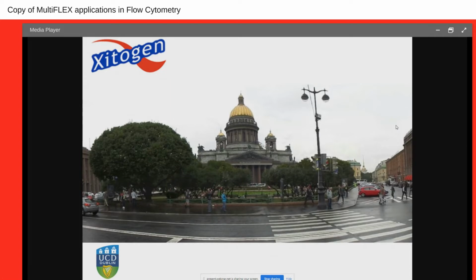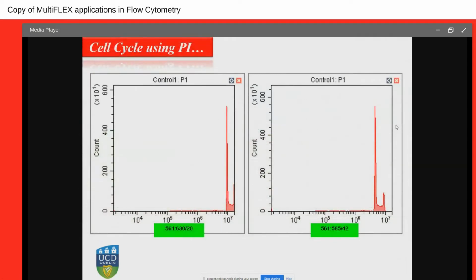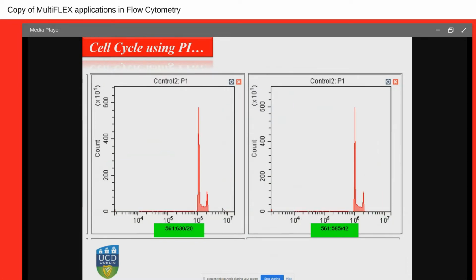So as I said, similar to the normal voltage. This is my signal, fluorescence intensity from the propidium iodide, very bright signal. As you can see, it goes completely off scale. On this other detector, it's on scale. But if I want to place both of them in the same place, the only thing I have to do is decrease the gains that we are applying into the channel. And that's what we do. Similar, as I said, to how the photomultiplier works. With photomultipliers, you're changing the voltage. With these avalanche photodiodes, what you're changing is the gain.